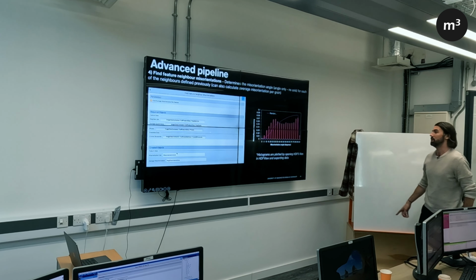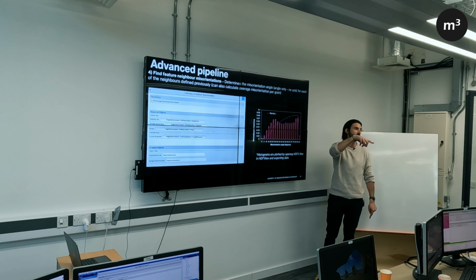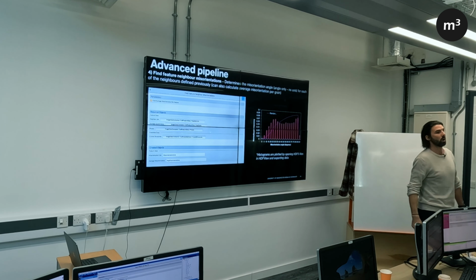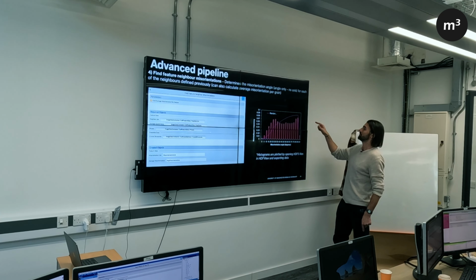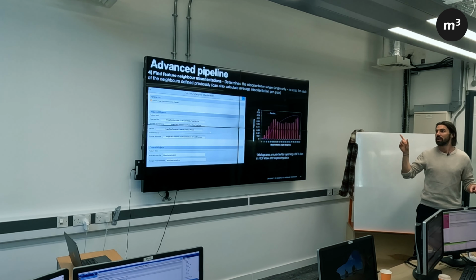And then you can plot it. I plotted this just using HDF view, just extracted the data as we did with the size data, and you can plot your misorientation angle distribution, which is quite powerful. The important thing is that this is only plotting the angle, not the axis, but you do have the orientation of each of your neighbouring grains.